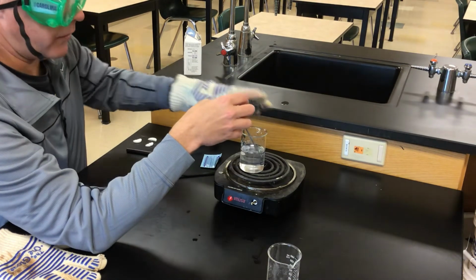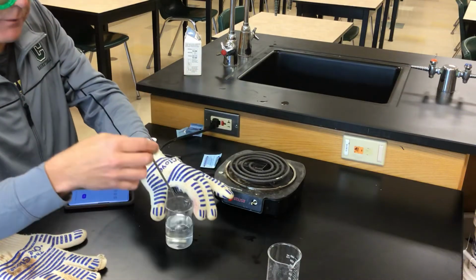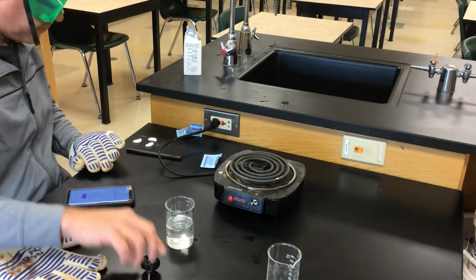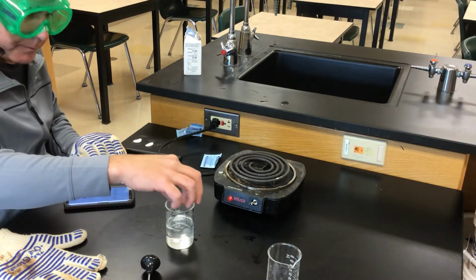Stir the water a little, which helps. It's at 35, so it'll be at 36 sure enough, very soon. And I'll do the second.